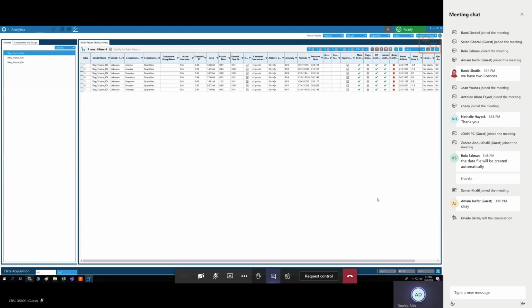Let's get started. We'll spend the rest of the day, we have just over an hour, to learn how to process this table and to look into our results. If we do that in a good way, then tomorrow morning we can start the non-targeted analysis by the automatic analytics way, and then tomorrow afternoon we can continue in the manual.